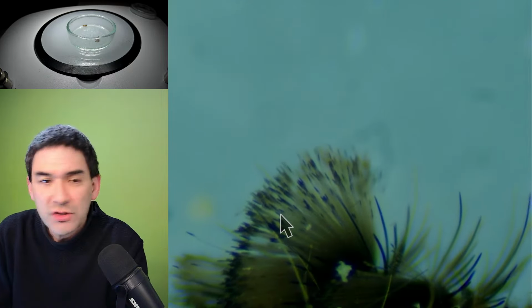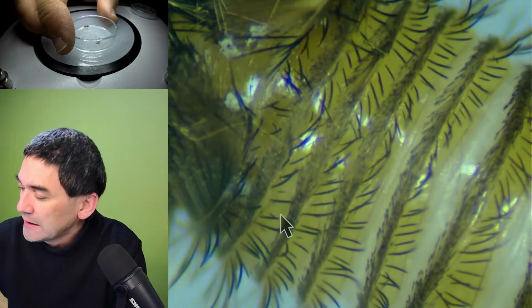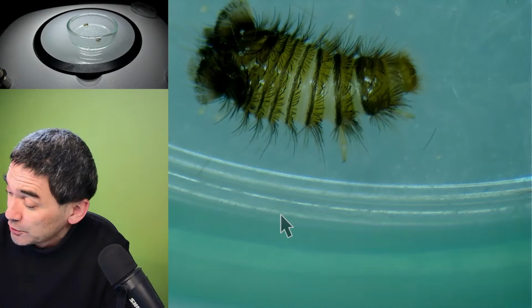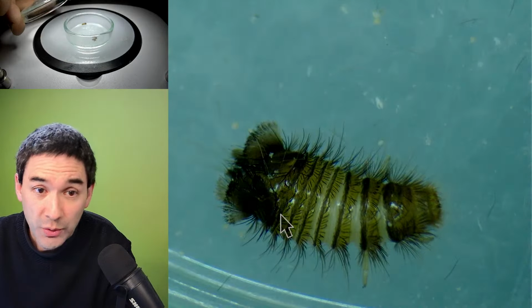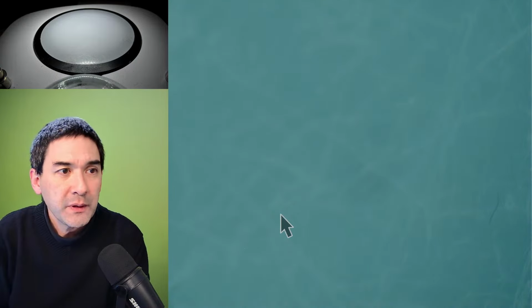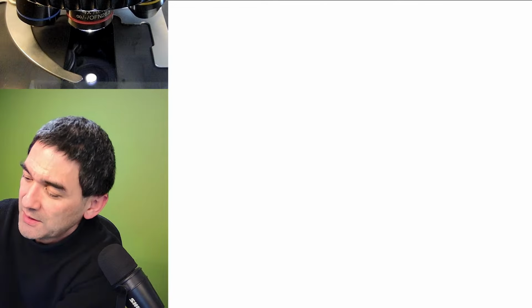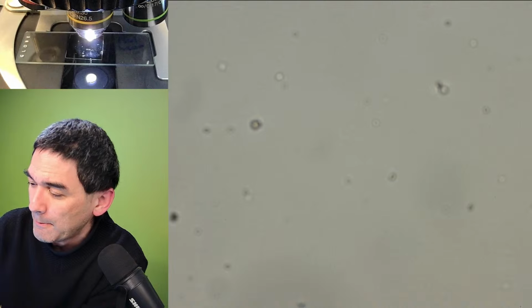This is a so-called carpet beetle. It's the larva stage, and apparently it's not good if you find them in your home because they eat carpets, because carpets are made of wool, which is an animal fur. I put a lid on top now, just in case you're wondering. And what I'm going to show you now is some of those, because I've also been able to find them in some dust samples as interesting fibers where I did not know what they were.